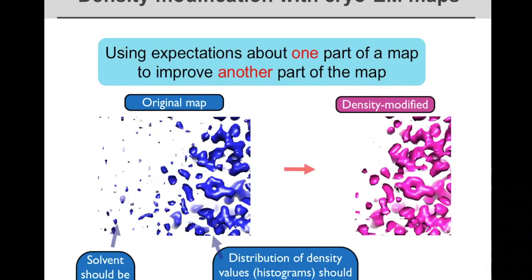And this is going to be the consistent thing about density modification and cryo-EM, is that the low resolution data in general is already very, very good. And you're going to improve only the highest resolution part of it. That's not true in some cases. Some cryo-EM maps have relatively poor information throughout the resolution, and those can be improved more with density modification than others.